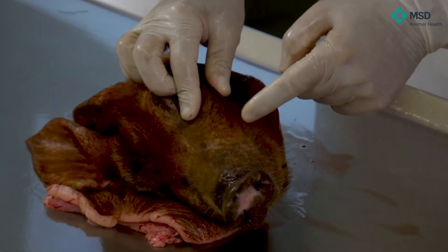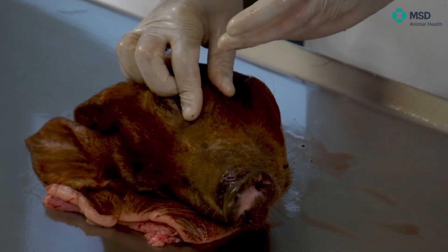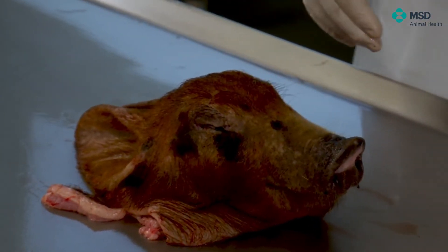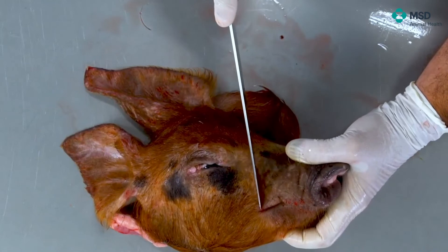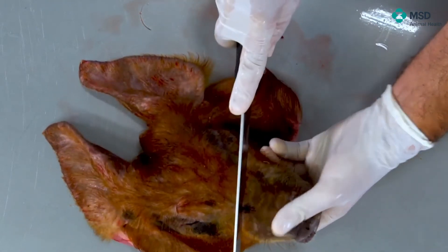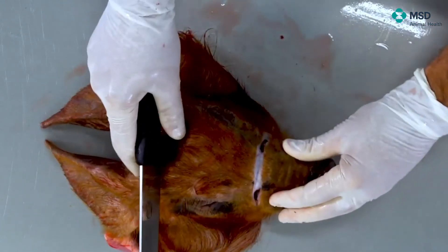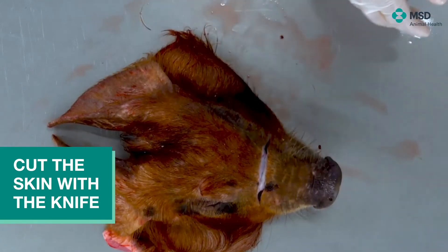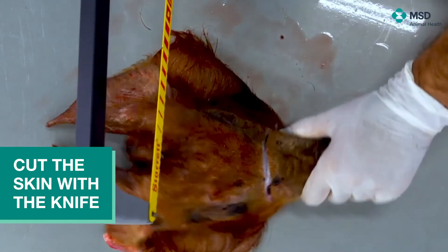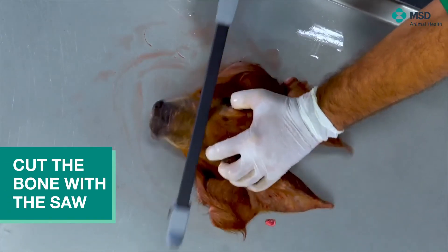We will cut exactly at that level. For this, we will use a saw. However, the saw cannot easily cut the skin, so for the skin we will just mark here at the labial commissure and cut using the knife. Then we can cut at this level by means of the saw.